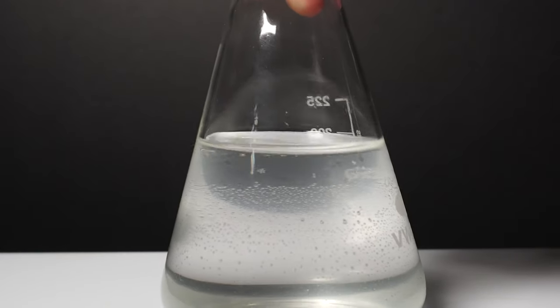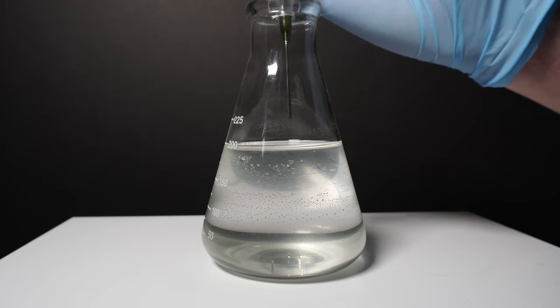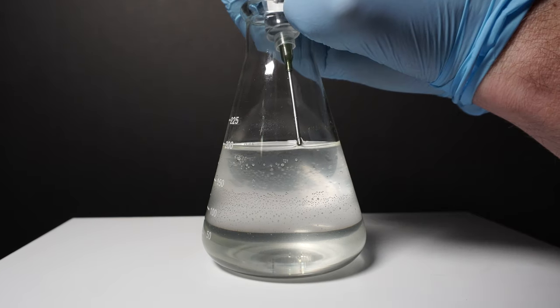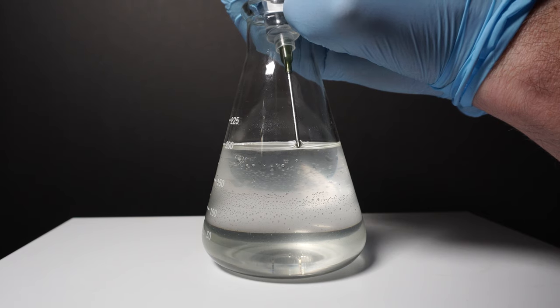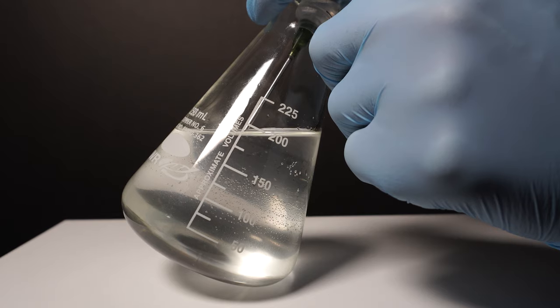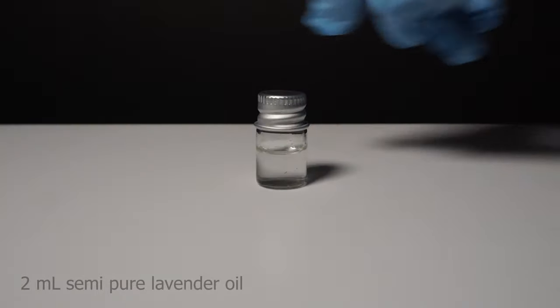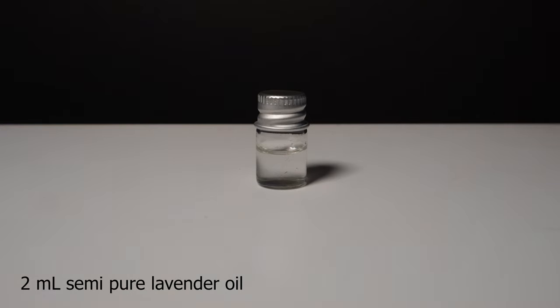We can see that a nice layer of oil has formed at the top of the flask. I could use a separatory funnel. However since there was such little oil, I decided to use a syringe to pull off the top layer. Tipping the flask to one side will sometimes let the oil build up and make it easier to syringe off. From here we can see my poor yield of just about 2 milliliters of semi pure lavender oil. Once again if I used fresh lavender my yield would have been much better.